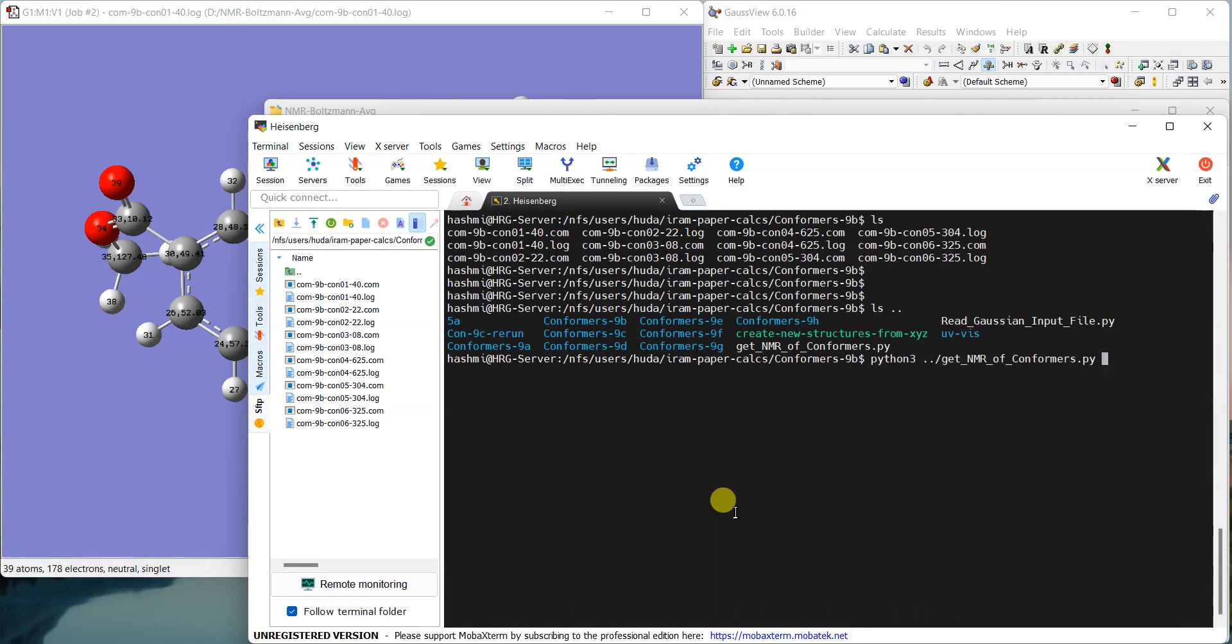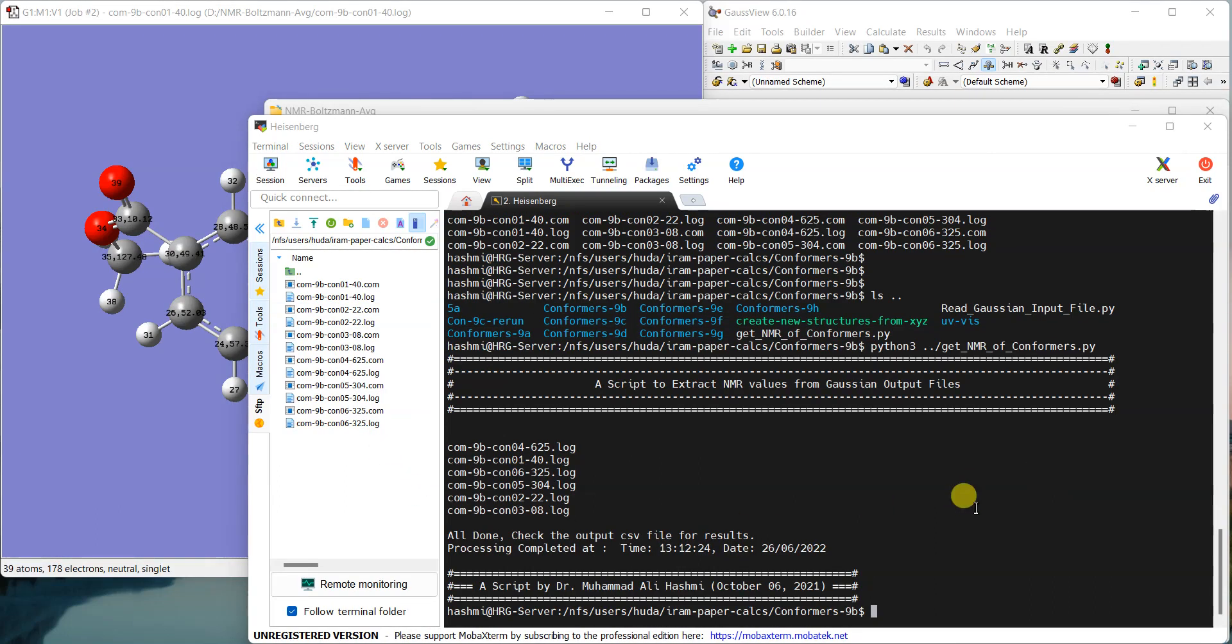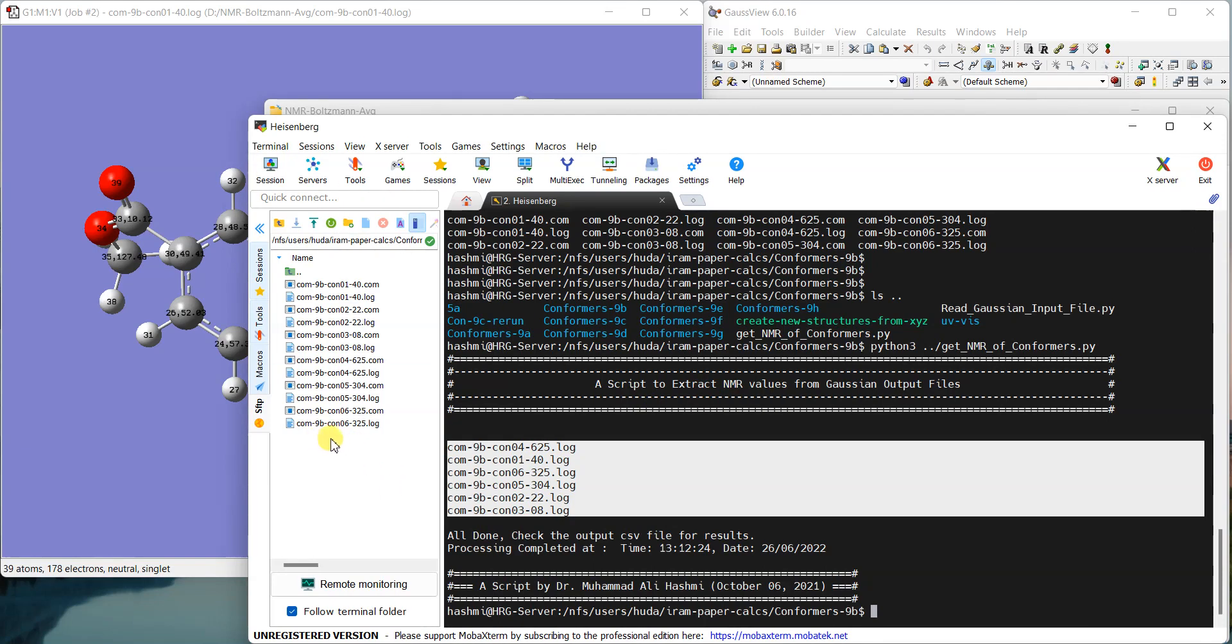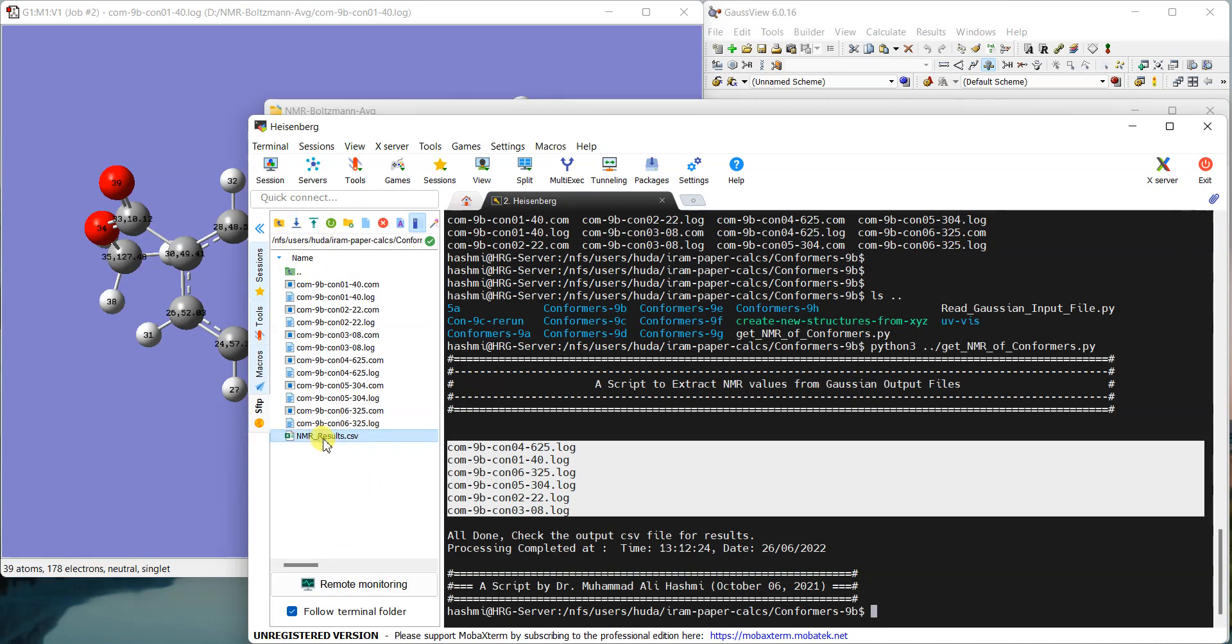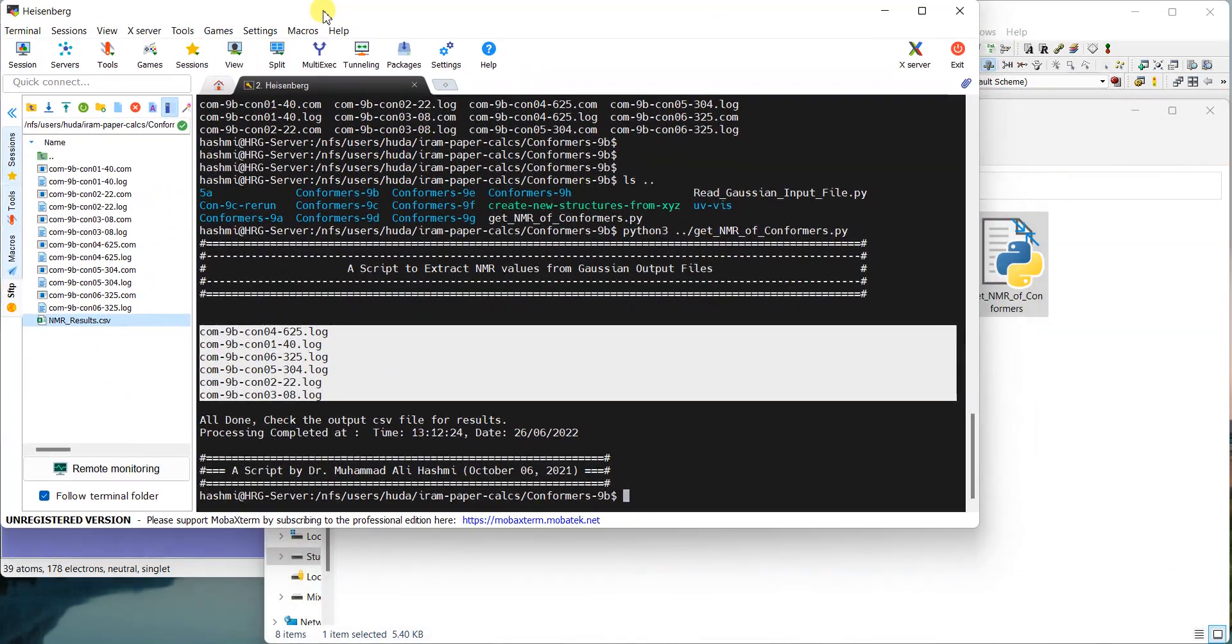If I run it, it will just go through all the log files and give me the summary at the end. You can see that it has given me the summary that it has gone through these files and all the work is done you have asked it to do. Now if I refresh it, you can see that a file will appear here. Yeah, this is the one—NMR results.